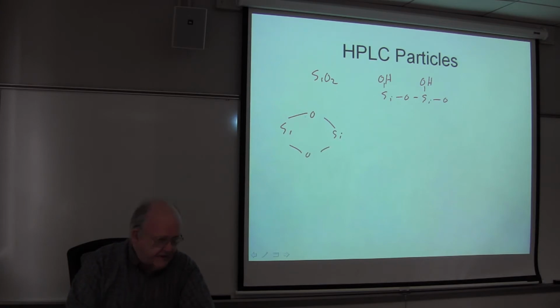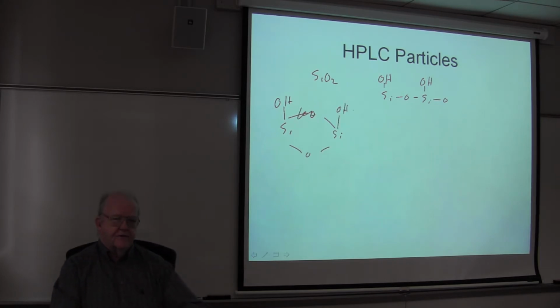These rings open and they become OH groups, which are vastly more polar than SiO2. And we'll get more into this in a little bit.